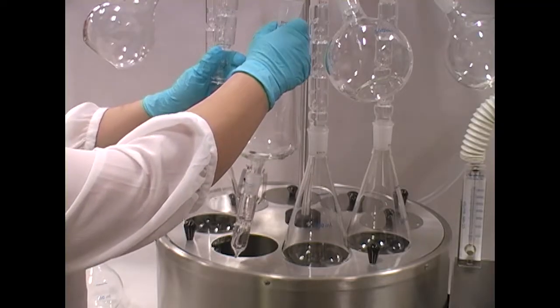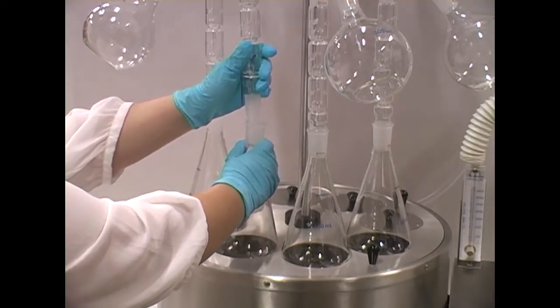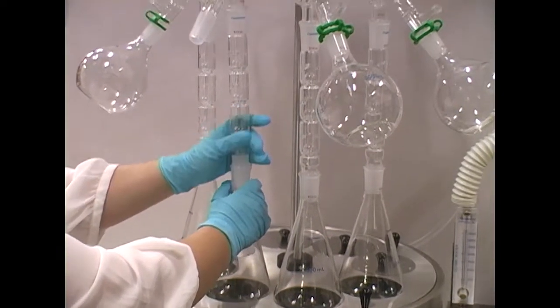A glassware set for eight 500 milliliter KD flasks with individual or central collection can be purchased separately.